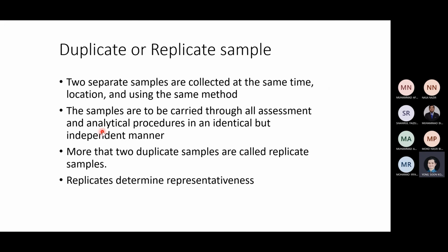Duplicate and replicate. I think this one no need to explain. I think this one is very common. Why do we need to do this? It is because we take several more samples.